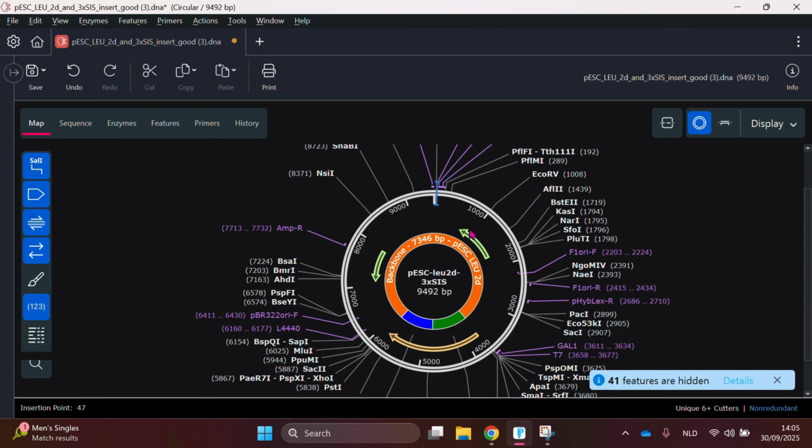And yeah, basically this was SnapGene 101. We covered what it is, how the interface works, how to open a sequence, how to design primers, simulate cloning, and share your primers.